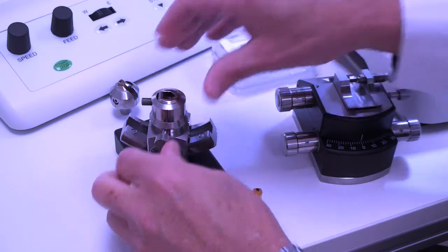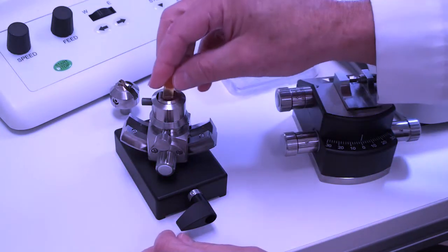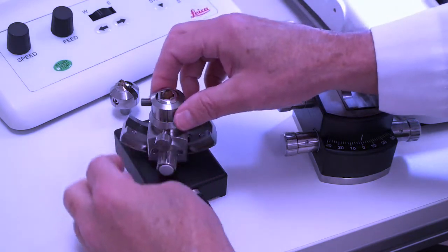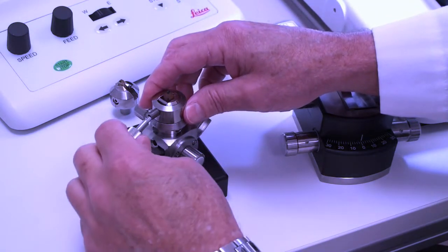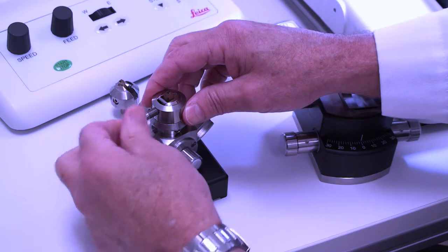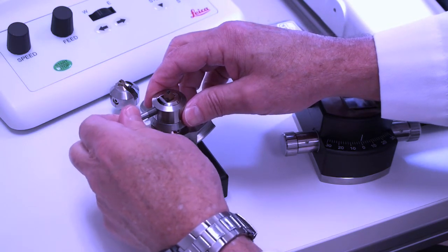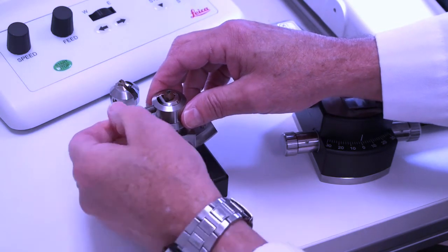And when we tighten these, you want to make sure things are nice and tight. I'm going to put my sample in and using the same Allen wrench key, I'm going to tighten that up. And again, you want to make sure that your sample's nice and tight so it doesn't wiggle around.